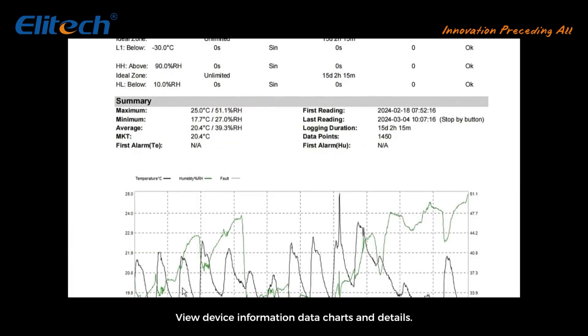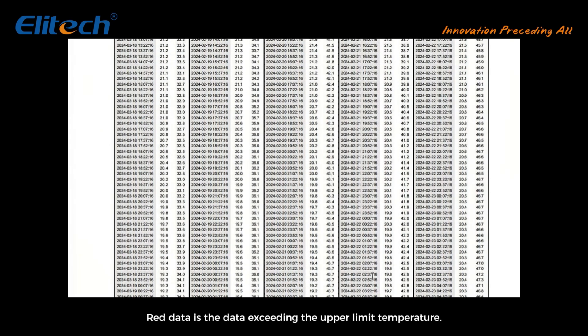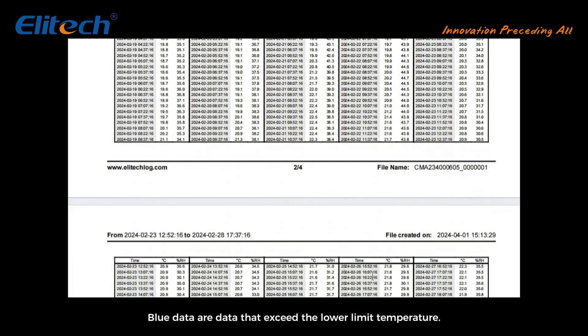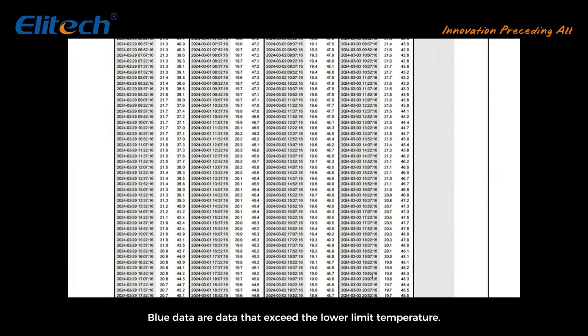Open the downloaded documents. View device information, data charts, and details. Red data is the data exceeding the upper limit temperature. Blue data are data that exceed the lower limit temperature.